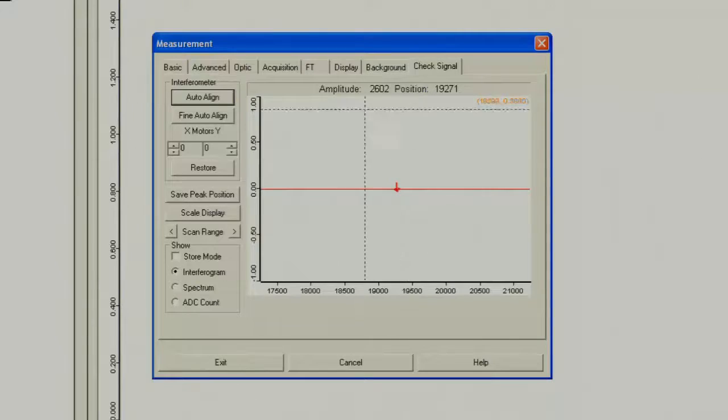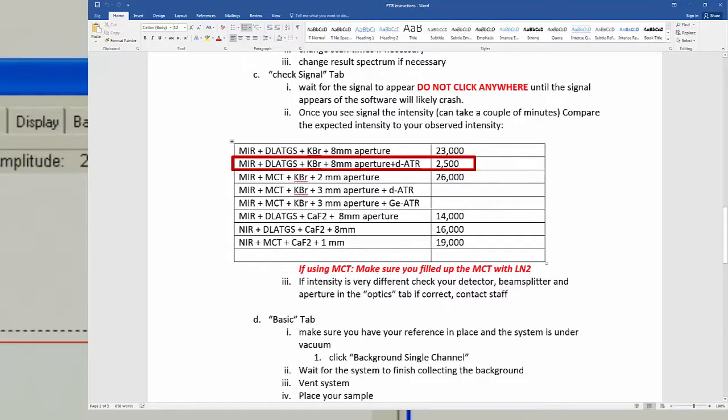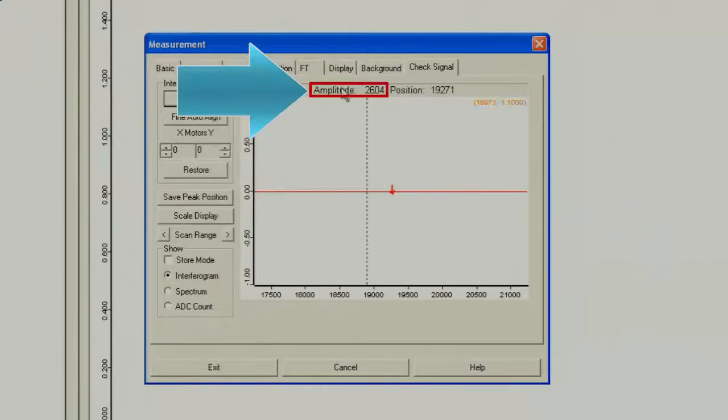Now there is a signal. If you look at the instruction table for the MIR, DLA TGS, and the Diamond ATR, the intensity should be about 2500 or more. For this example, you can see the intensity is about 2600. So there is more than enough, and the system is working properly.